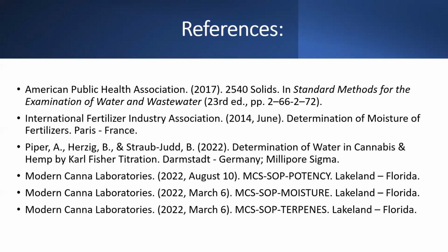Yes, and so I think that calculation was presented on one of the previous slides where we were taking the moisture we obtained plus the total amount of terpenes plus the total cannabinoid conversion. And when you add those values together, you're going to get a value that is looking at total loss, similar to what a loss on drying method looks like.